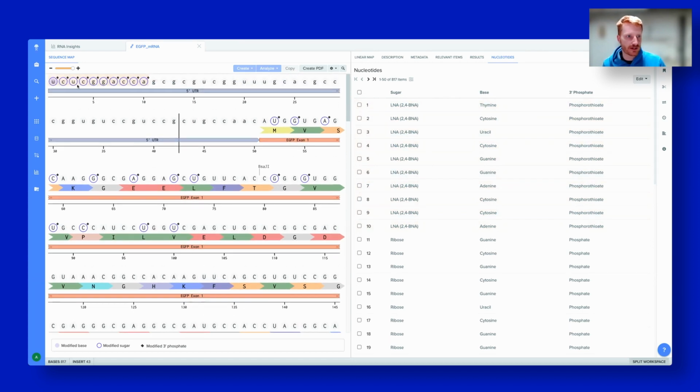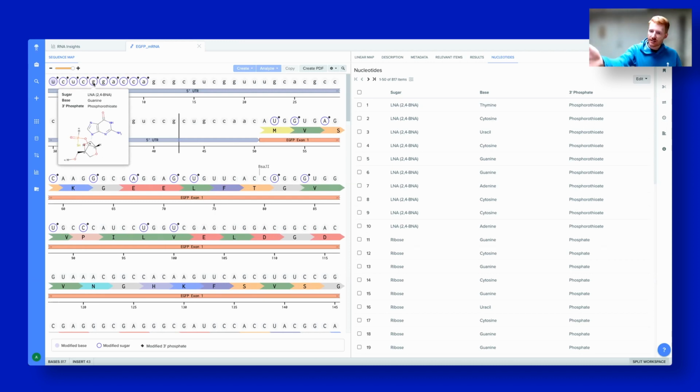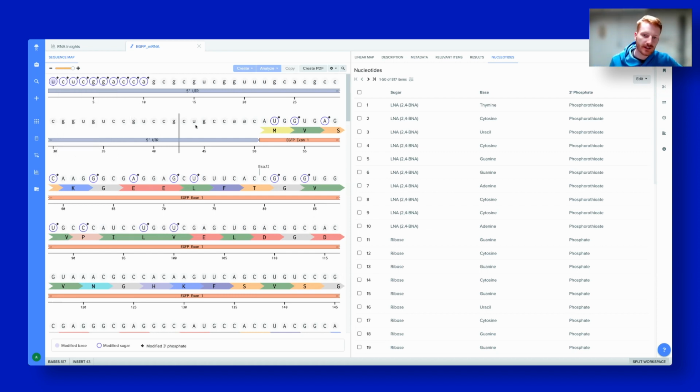So if I scroll to the top now, you can see they've been updated here. And again, they reflect the changes listed on the right-hand side. It's easy to read. It's quick to identify that these have some sort of chemical modifications with them. And it would be consistent across my team's usage of the platform and our sequences.